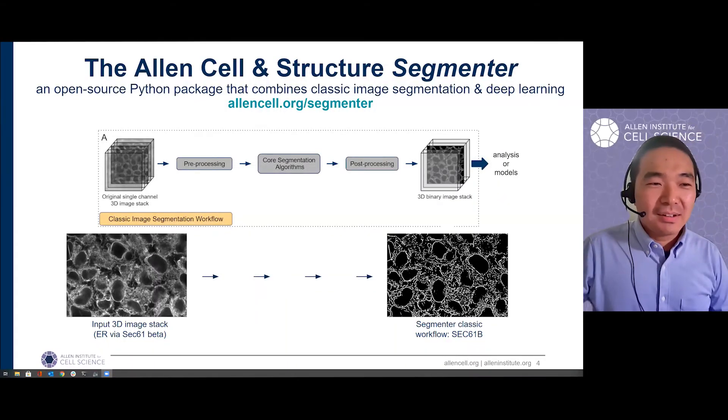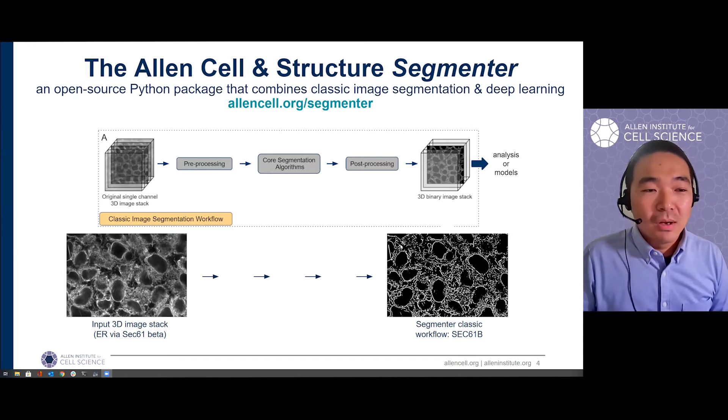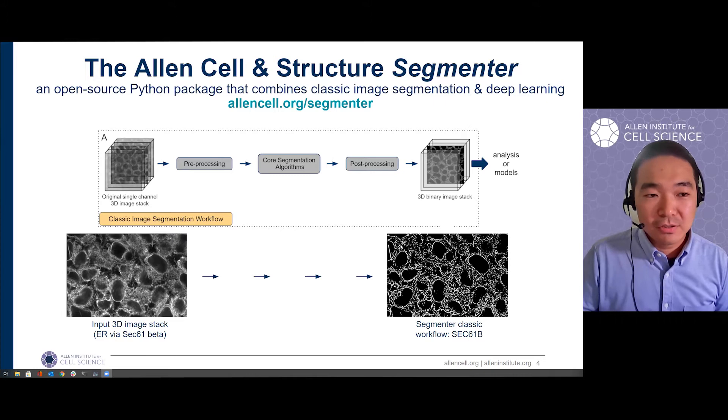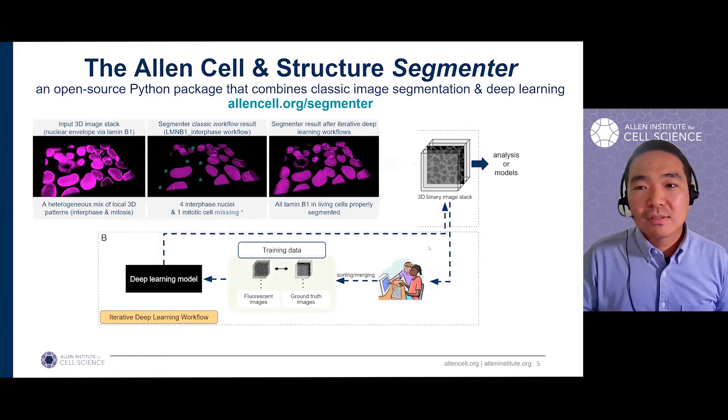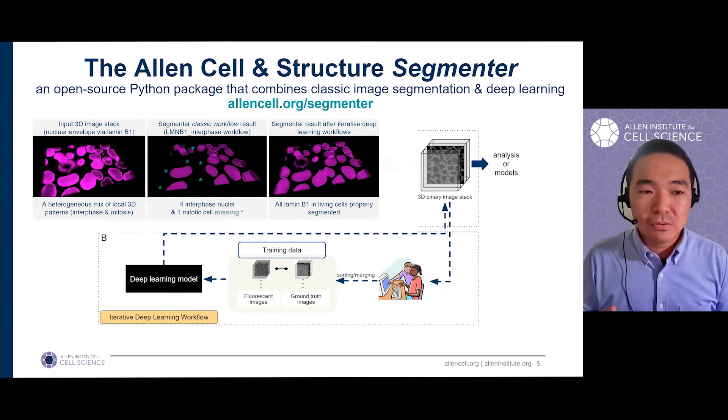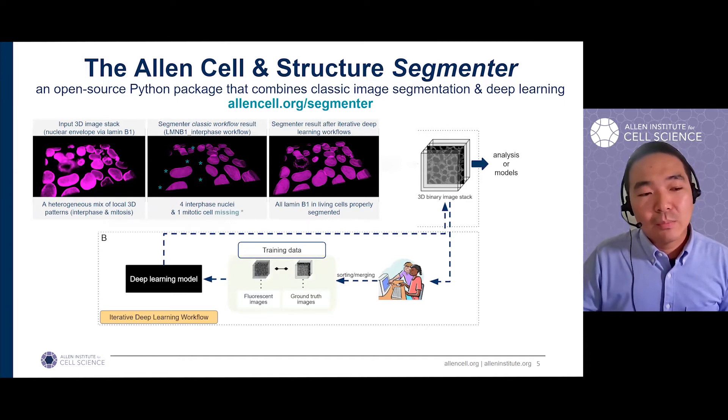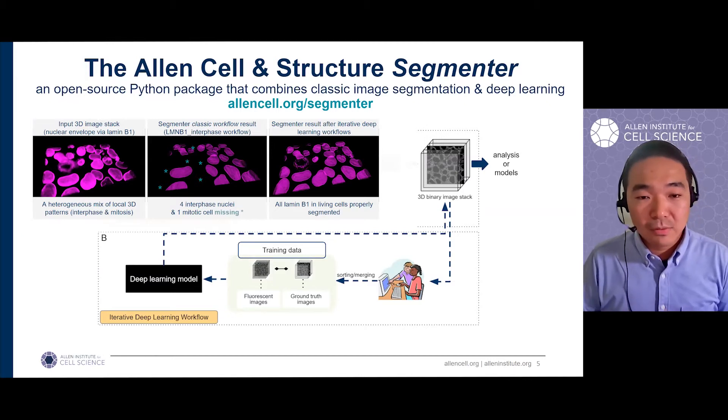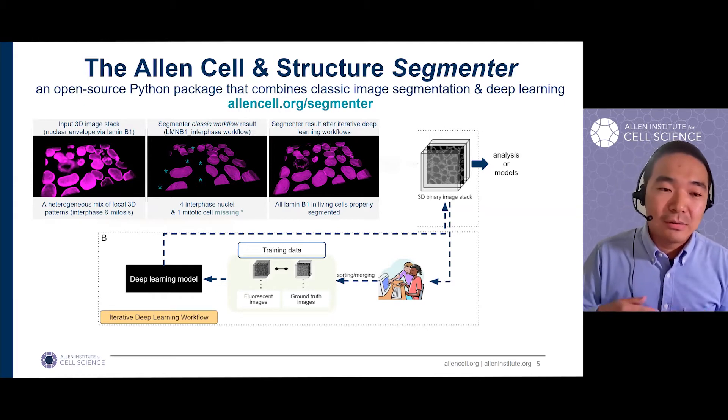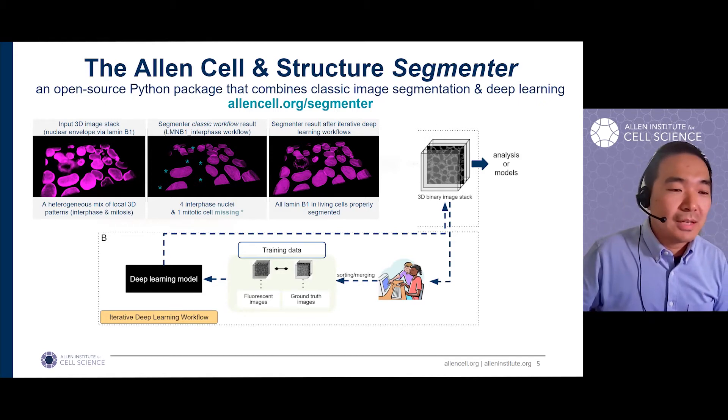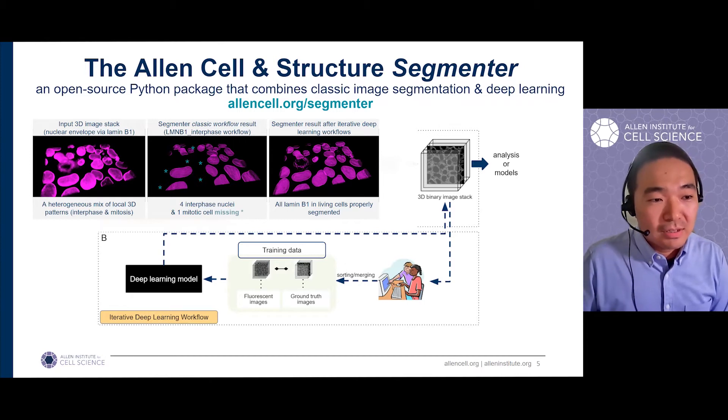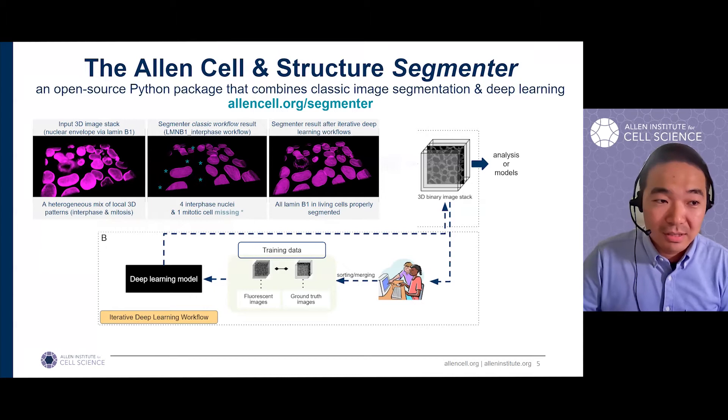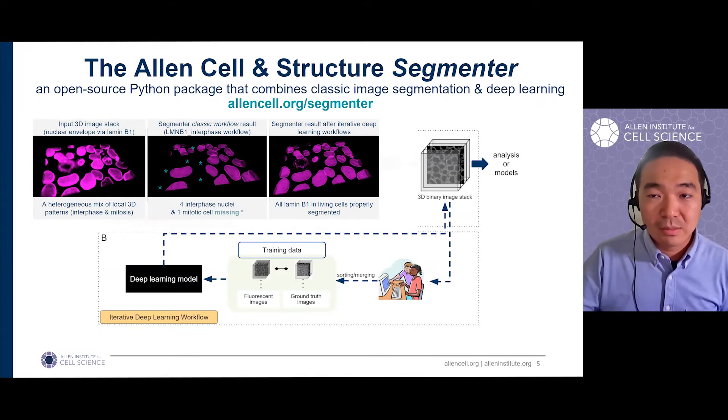For the classic part of our segmenter, it is formulated as a simple three-step workflow. In each step, there are a very restricted number of functions to select from and very few parameters to adjust. When the classic segmentation algorithms are not enough, the iterative deep learning workflow can be used to improve the segmentation accuracy and robustness. Here we prepare the training data by taking the preliminary result from the classic segmentation workflow and we curate the result instead of manually annotating the ground truth in 3D pixel by pixel.